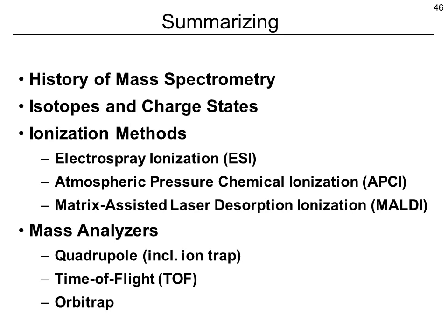On the mass analyzer side, you heard about the quadrupole, as a transmission quadrupole, and as an ion trap. The time-of-flight mass analyzer, including the Reflectron, and the Orbitrap mass analyzer.